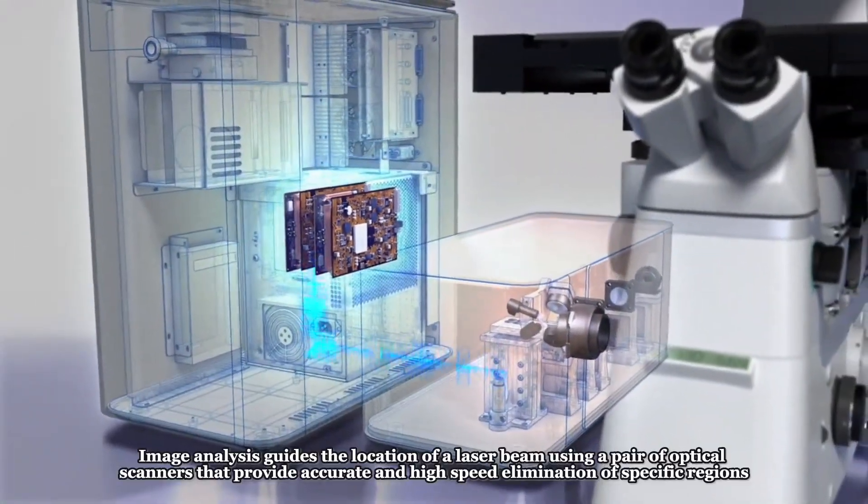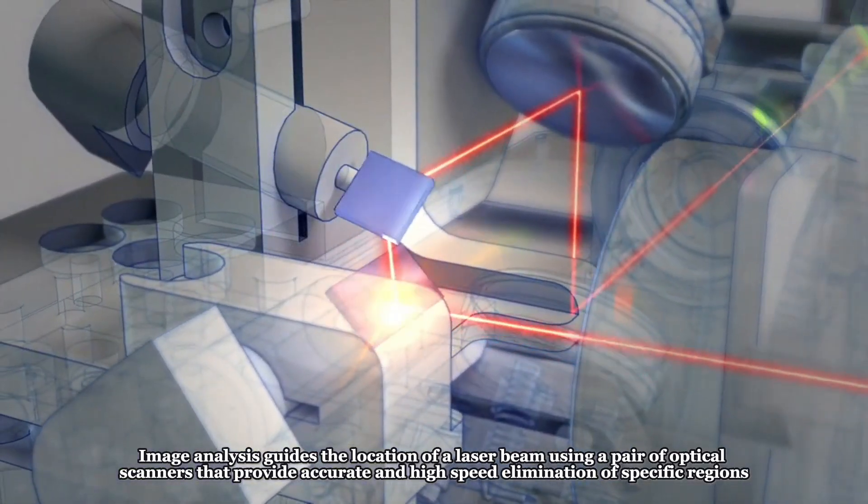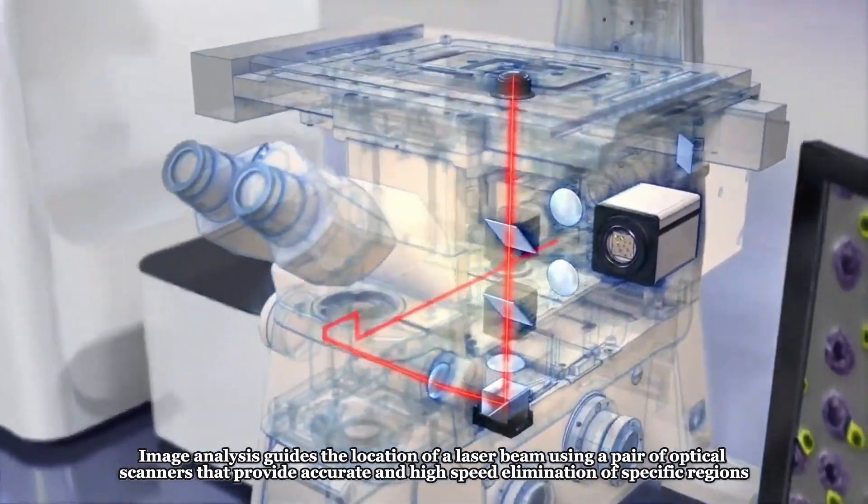The image analysis guides the location of a laser beam using a pair of optical scanners that provide accurate and high-speed illumination of specific regions.